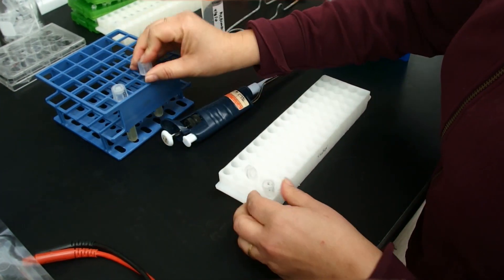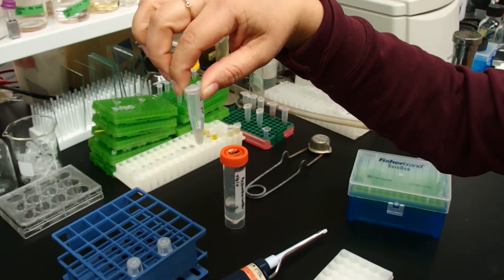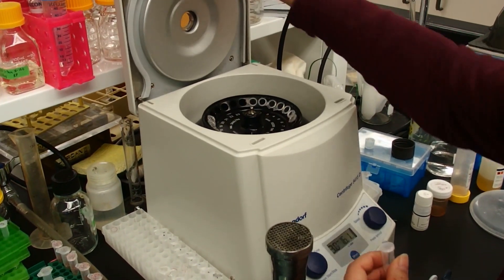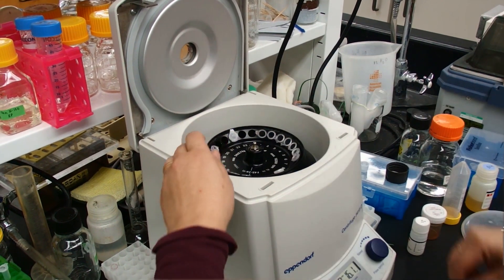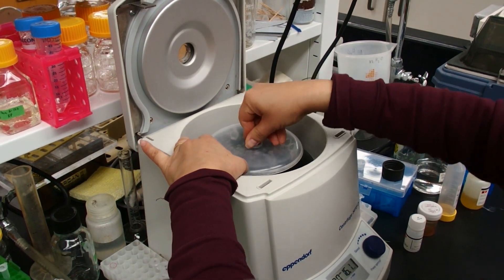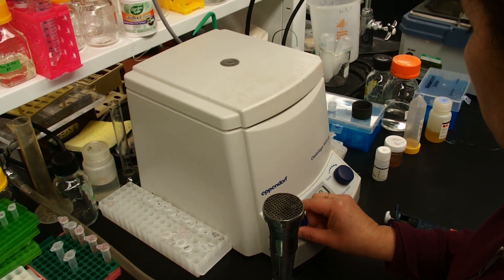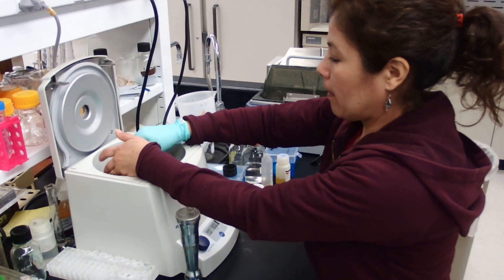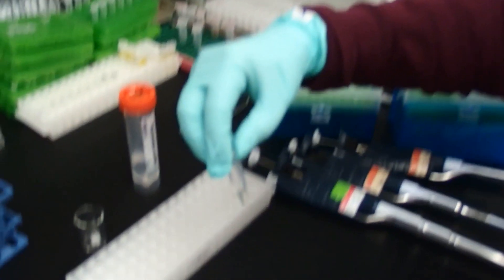We put them together and now we are going to spin it down in the centrifuge. The bacteria culture has already been pelleted.